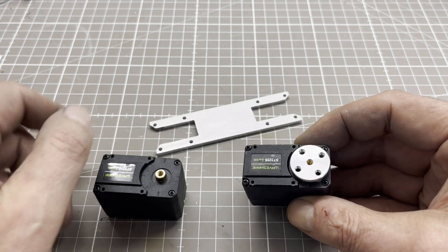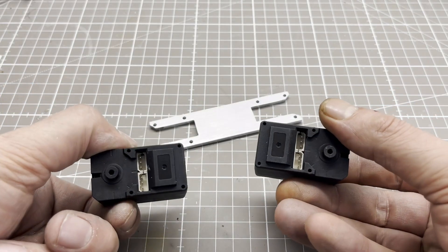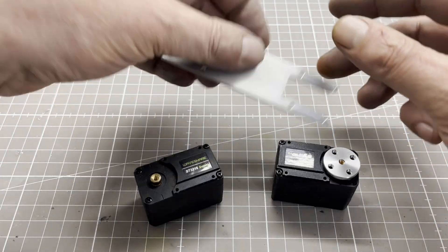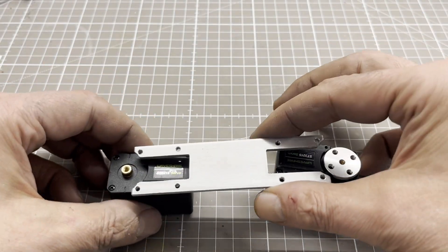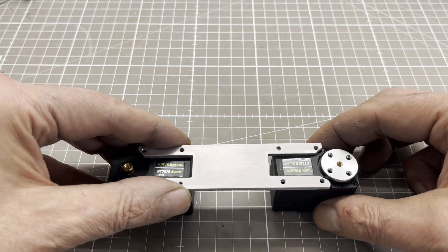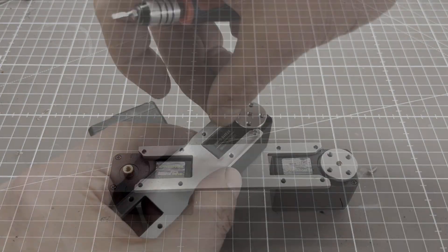For my HPLC project I need an autosampler, so I am building one. It will be designed as a SCARA robot. In this episode we will be working on the robot's forearm. All of the aluminium parts you see in the video are handmade, as I don't own a CNC mill or metal lathe.